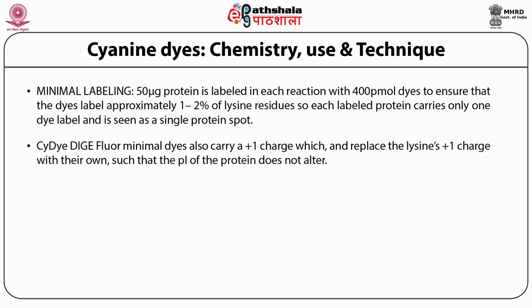Since these dyes are hydrophobic, they have a tendency to precipitate the proteins, and therefore only one lysine residue per protein is labeled, and therefore called as the minimal labeling. Minimal labeling limits the fluorescence intensity and thus the sensitivity of the stain, which could be taken as a disadvantage.